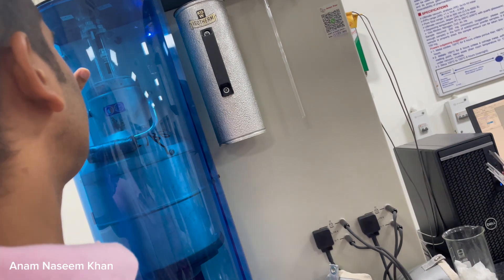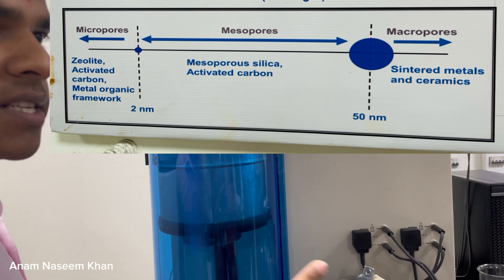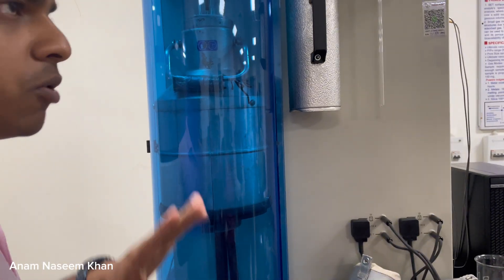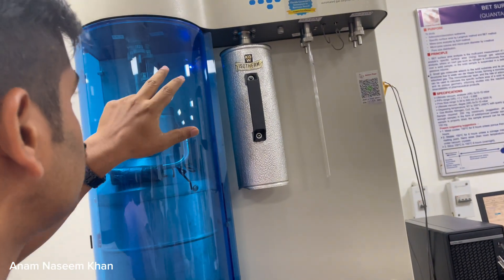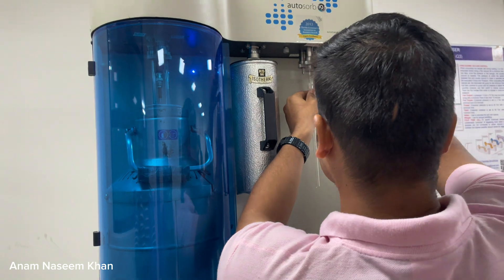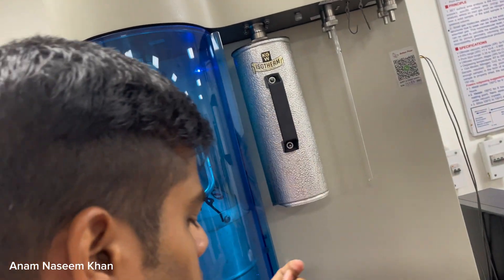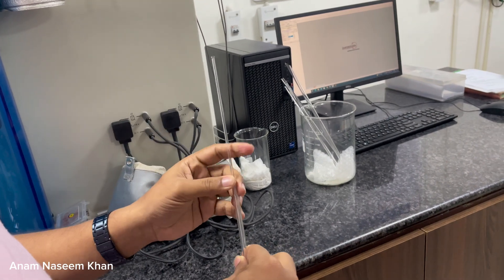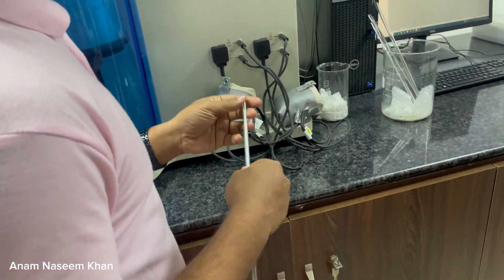There are three stations. In station one, we can calculate micropores, mesopores, and macropores — micropores have a pore radius less than 2 nanometers, mesopores are 2 to 50 nanometers, and macropores are greater than 50 nanometers. In stations two and three, only mesopores can be calculated; micropores and macropores are calculated only in station one. Here is our sample attached to the manifold. You can use a filler rod to speed up the vacuum process, though it is optional.